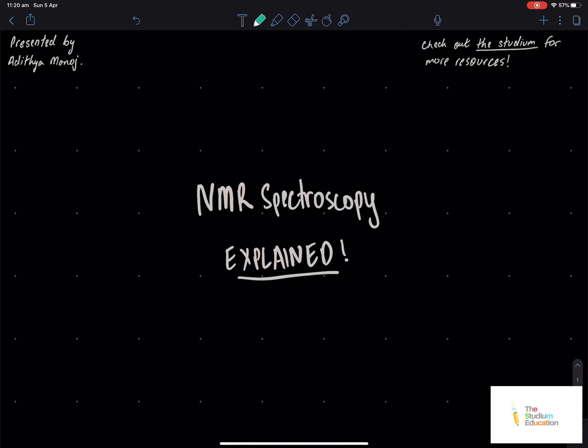Today we'll be looking over NMR spectroscopy, or nuclear magnetic resonance. Now, what this video aims to do is to give you a basic conceptual understanding of NMR. It's not a be-all end-all video. There's going to be a part 2 to this which goes into the specific details of how NMR works and what you will actually do in exam situations. But for now, this video aims to give you a basic conceptual understanding, more the foundation you need to move on to more complicated stuff. Now, what I'll be doing is presenting you the concepts and showing you how it is manipulated in NMR spectroscopy. Okay, so let's get started.